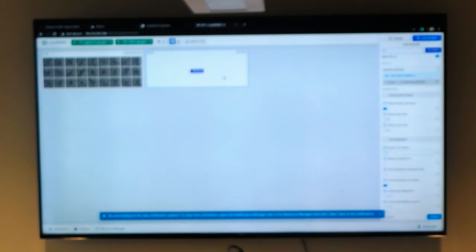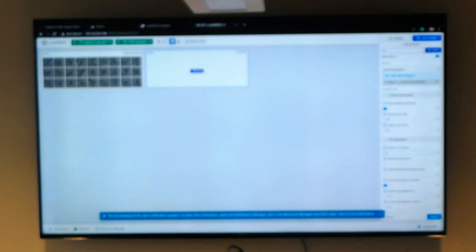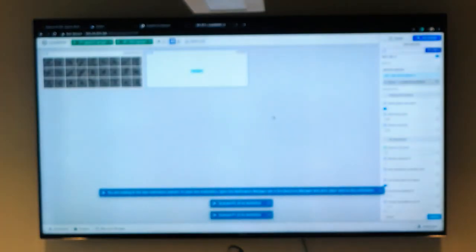You can either select the job that's building again and go here, but if you're somewhere else and you cancel, you can always hit B. Let's say you came out here and you want to go back to this job, you want to build it. You can click on it, but you can also hit B and you get back into the builder area. And then don't forget when you're starting to run, you hit this node, the workshop node, to run your jobs, and it'll launch and it'll run.